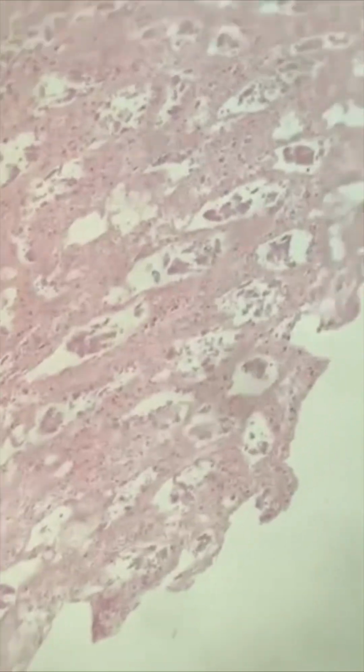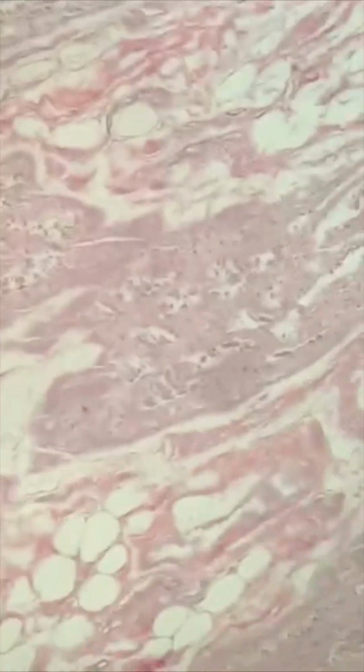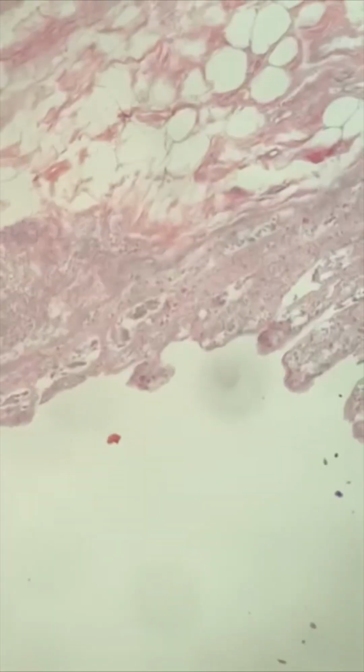So here's ischemic appearing tissue. I think this is intestinal tissue. Yeah, you can see that the glands are all autolytic or necrotic from ischemia. That could have been from me with the autopsy, but anyway, you can see that.